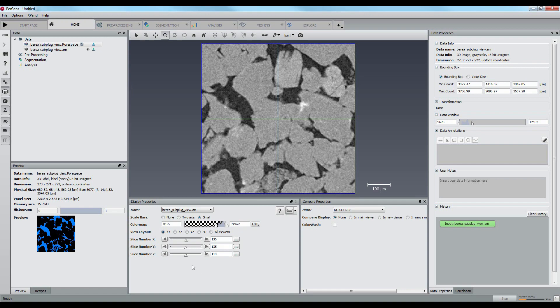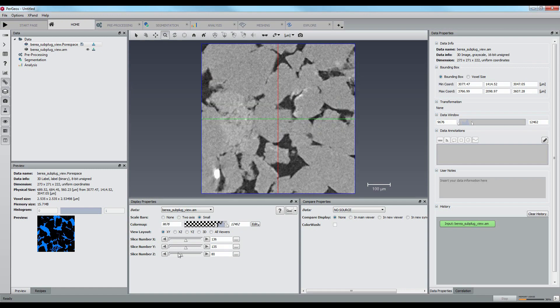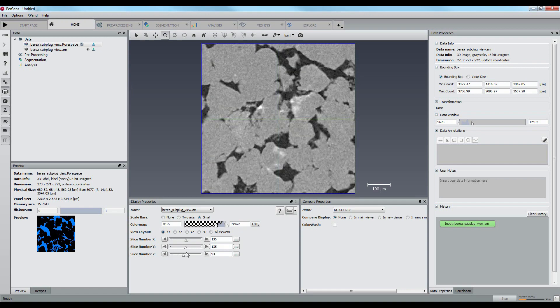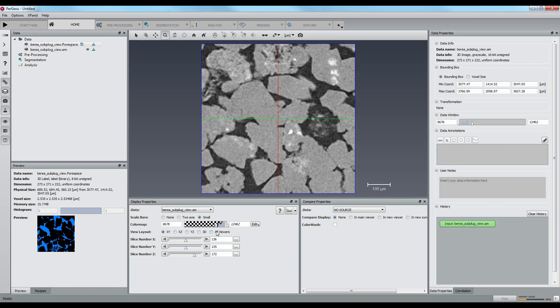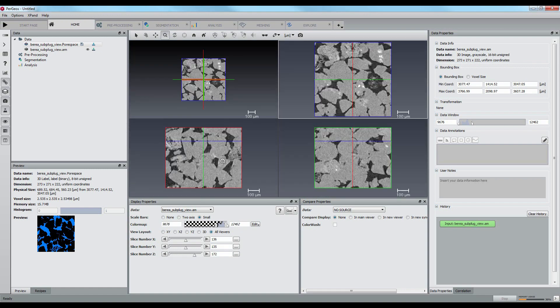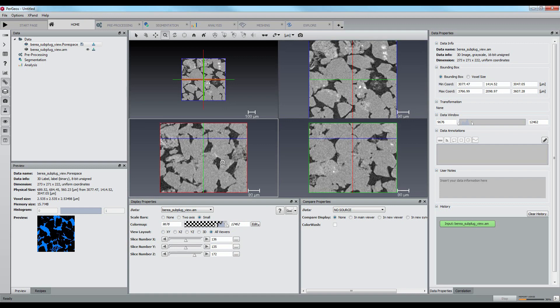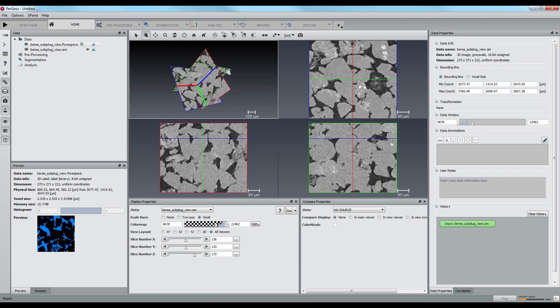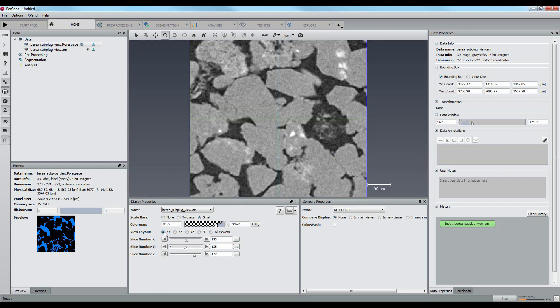This tutorial will show you how to perform a pore space analysis on a sandstone sample. We will determine the porosity, connected porosity, and pore size distribution.